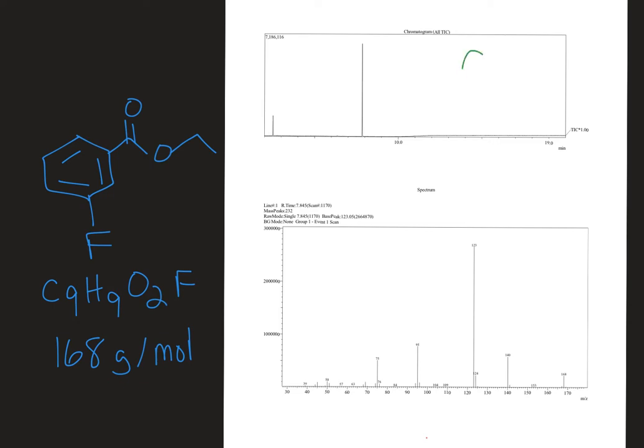So the top part here comes from the GC. This is the chromatogram you can see here and a peak is observed for every unique molecule that's in the mixture. So there's one molecule here and there's a different molecule there. They're separated out from one another based on polarity so that we don't have this complex mixture all coming into the mass spec at the same time.